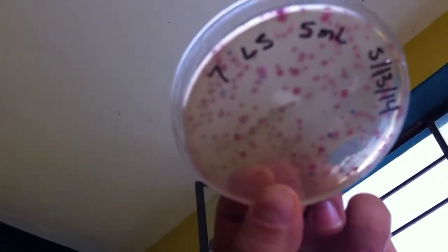They've been plated for a little over 24 hours now at not optimal temperature, but this grows anywhere from 70 to 99 degrees Fahrenheit. This is the water that, if we would have lined all of these up in a cup, I would have chosen to drink. It was purchased from Santa Elena and delivered to the house yesterday. So this is a sample from a home that they're drinking from. This is what they're swallowing with their medications when they're taking them. It is the most contaminated.